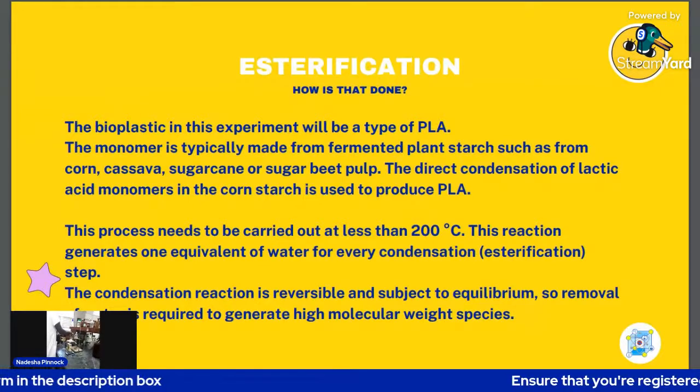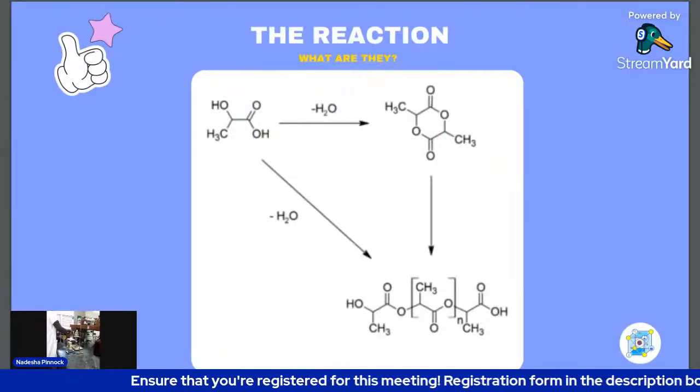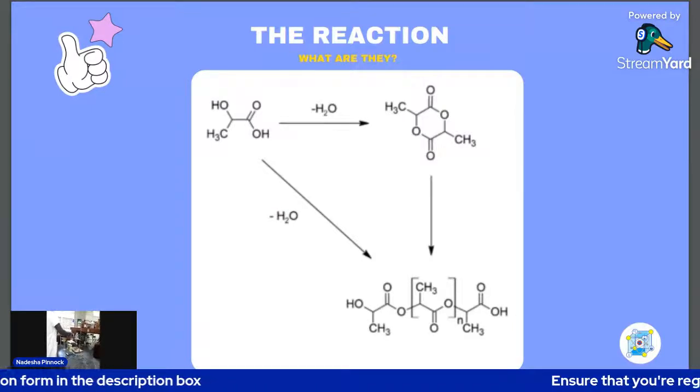We are carrying out the condensation of the lactic acid monomers in the cornstarch to produce the PLA. And this process needs to be carried out at less than 200 degrees Celsius. For each condensation that we're doing, so for each joining of the lactic acid, a single molecule of water is removed.